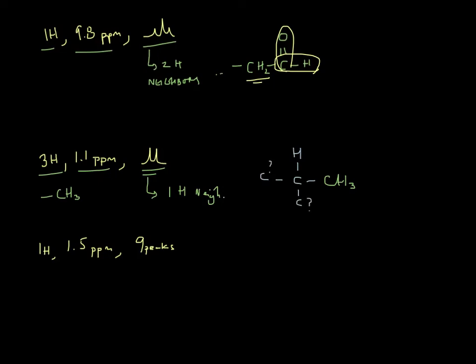We know those aren't hydrogens, and likely if those were oxygens or nitrogens or halogens, then our signal would probably not be so low. It probably wouldn't be at 1.1. So this would be my best interpretation of this molecule. It's a CH3 next to a CH that doesn't really have anything else complicated attached to it, at least at that point. All right, lastly, we have something that integrates to 1, so that means that we have a CH.